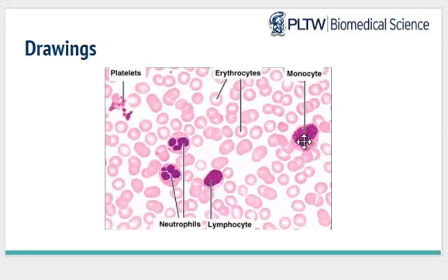The larger cells that you can see are nucleated. You also can see they appear a little bit darker in color. These are your white blood cells. There's lots of different types of white blood cells that exist in our blood. We'll learn more about those when we get to infectious disease. And then over here, a little bit smaller than your red blood cells and darker in color are your platelets, that will be involved in clotting and plugging up any sort of damage sustained to the circulatory system.